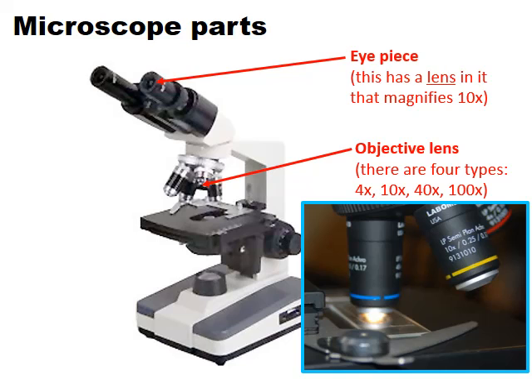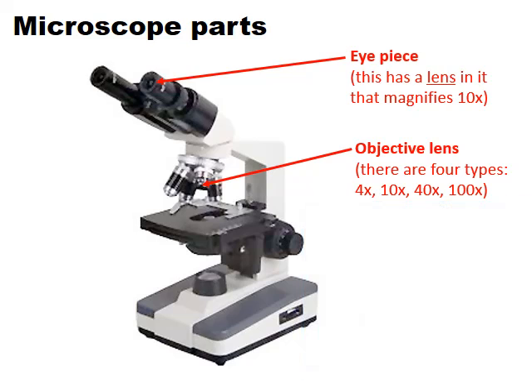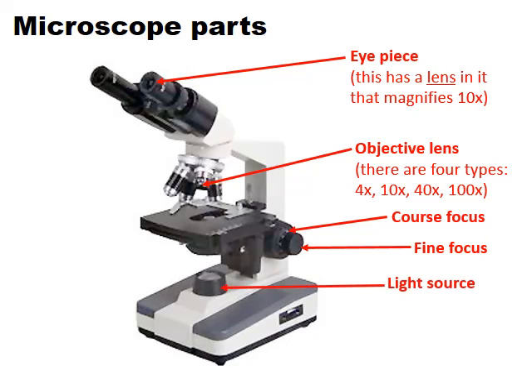A forty times objective gives a total of four hundred times magnification. In order to move the stage up and down to get our sample into focus, we use the adjusters at the back of the microscope. The larger of the two is called the coarse focus, which moves the stage in quite large increments to get the image into approximate focus. The smaller fine focus adjuster is used to get a sharp, precise image.